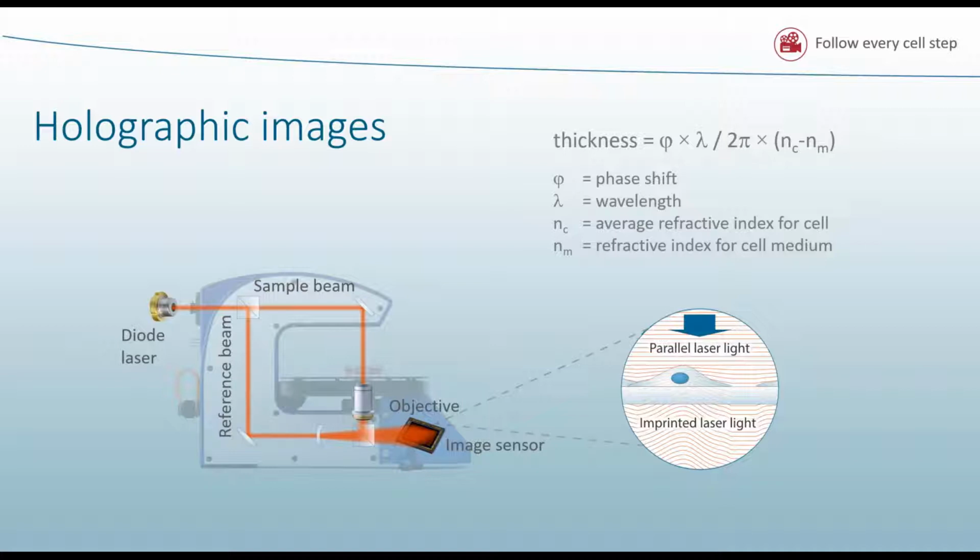So what happens when the light passes through the cell sample? You can see to the right, the circle tries to show wave fronts. Those are the red lines. And when the wave fronts pass through the cells, you can see that there is an imprint, a shift in the wave fronts. It's called a phase shift. That's our rawest raw data, that phase shift.